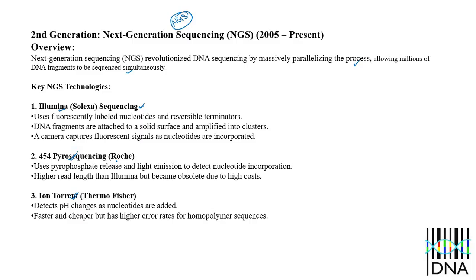What is the principle behind this pyrosequencing? Whenever a nucleotide is added into the growing template synthesis process, two phosphate molecules are released, and these two phosphate molecules are known as pyrophosphate. Here we focus on this pyrophosphate. That's why this sequencing method is known as pyrosequencing.